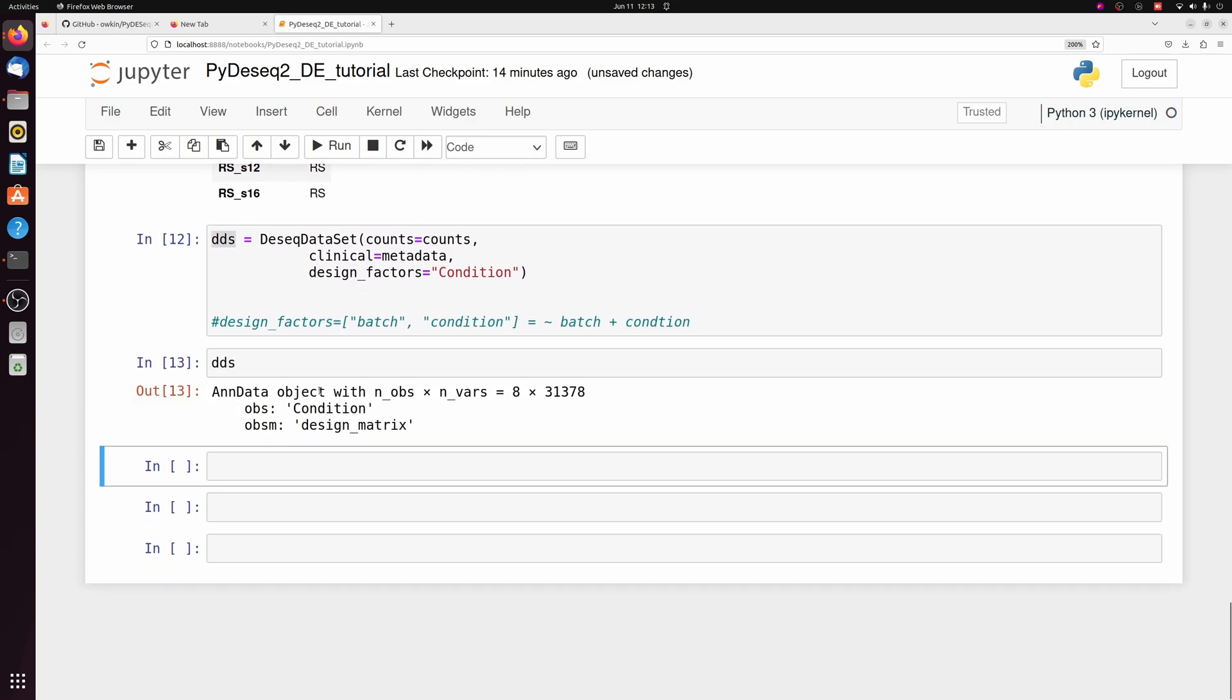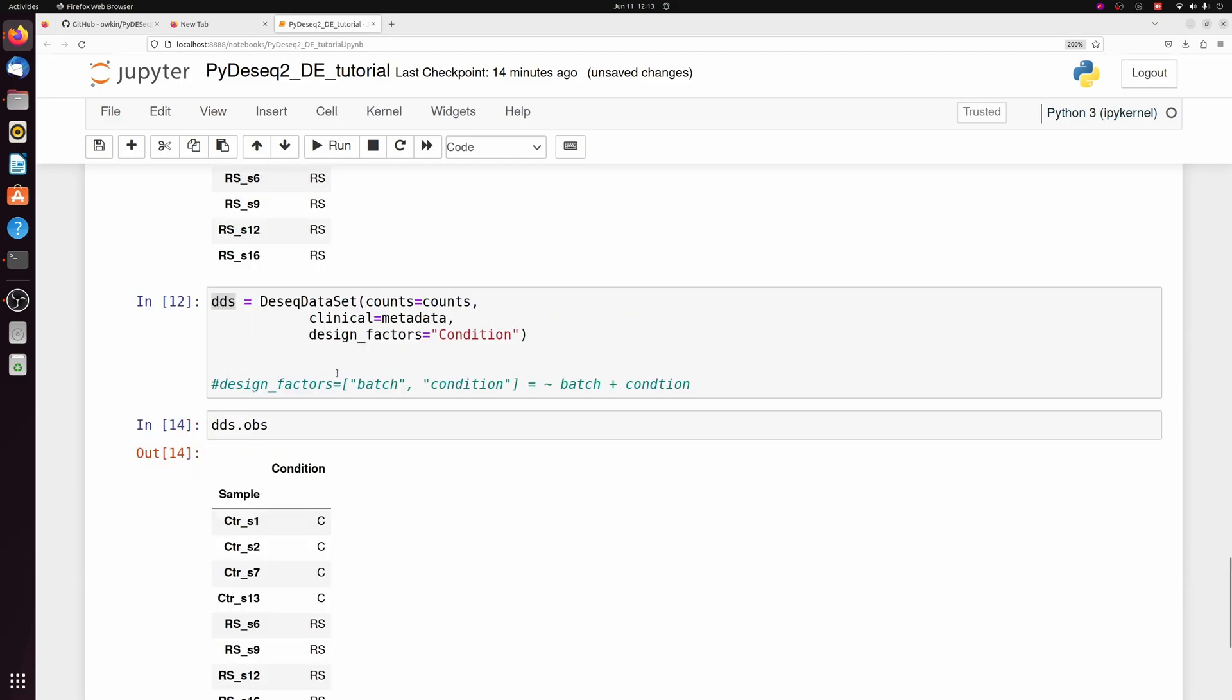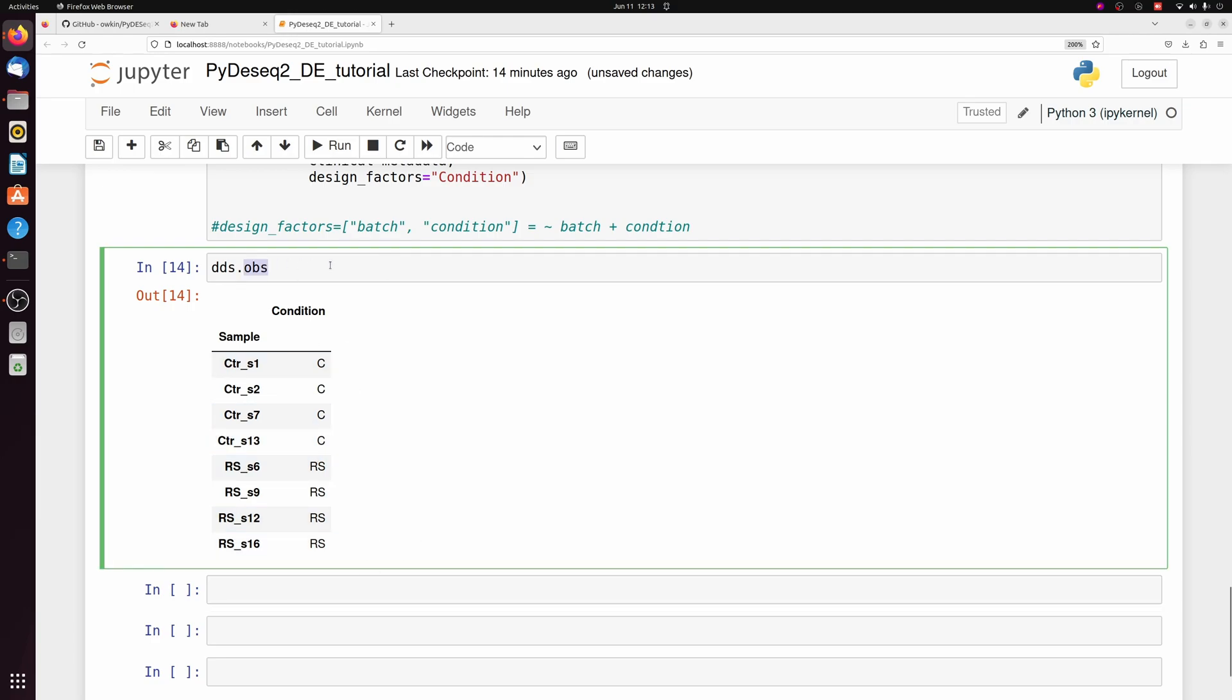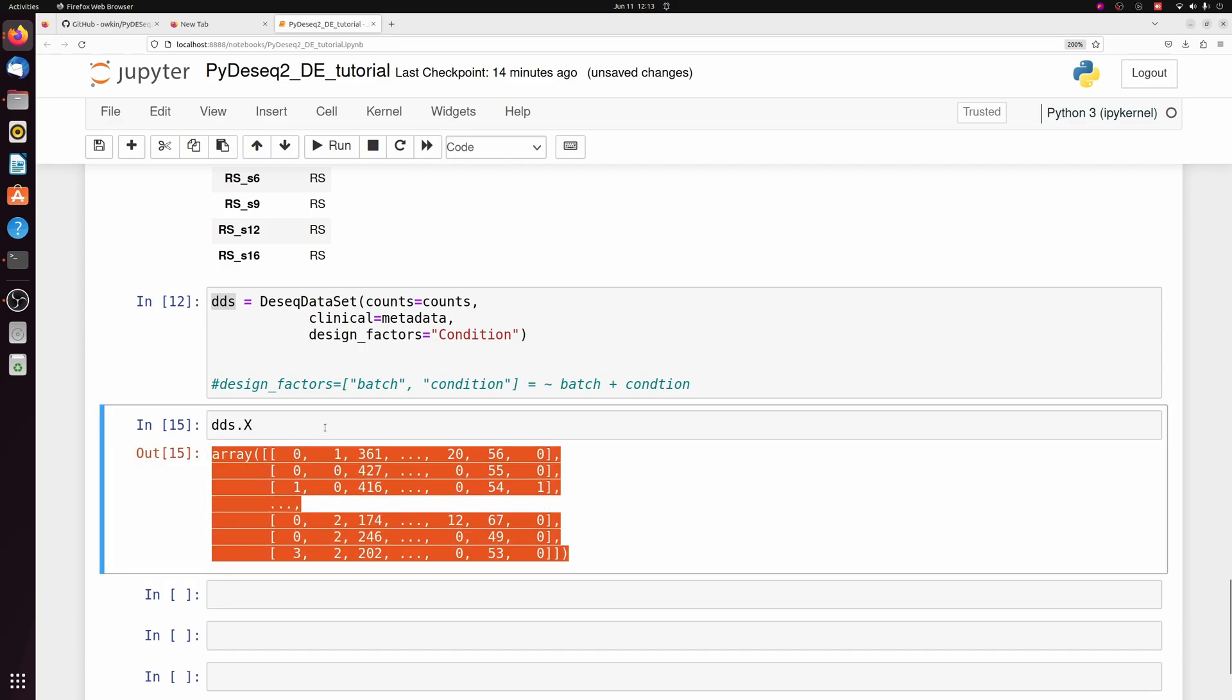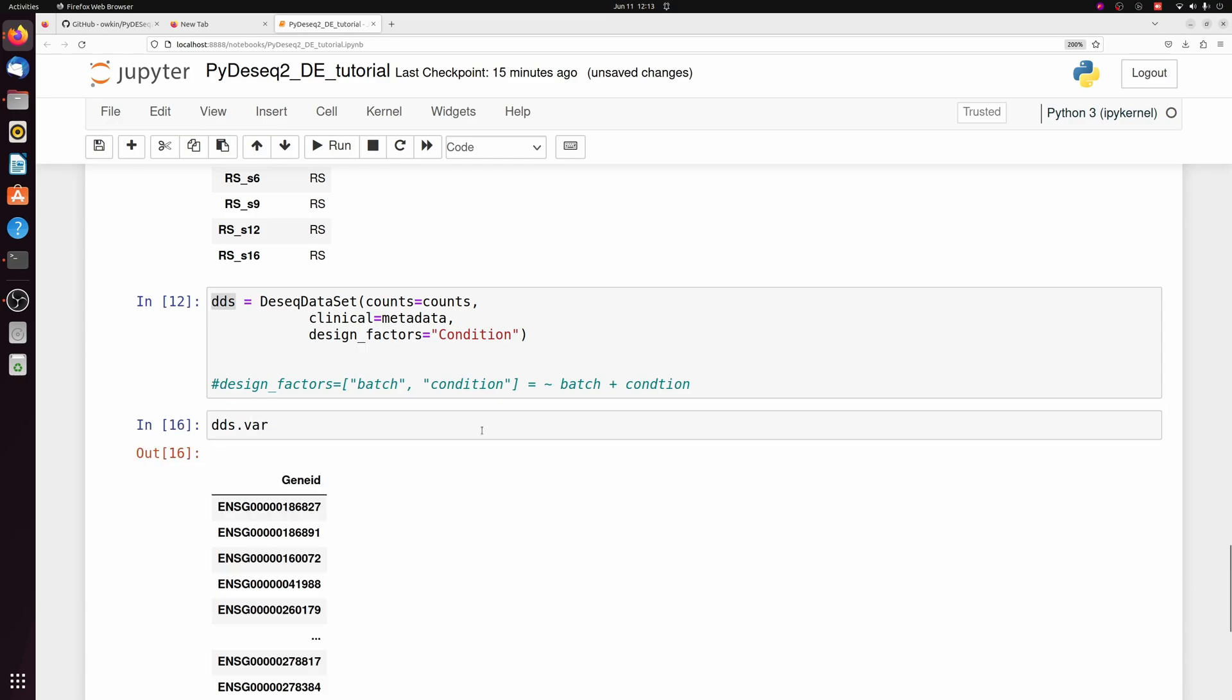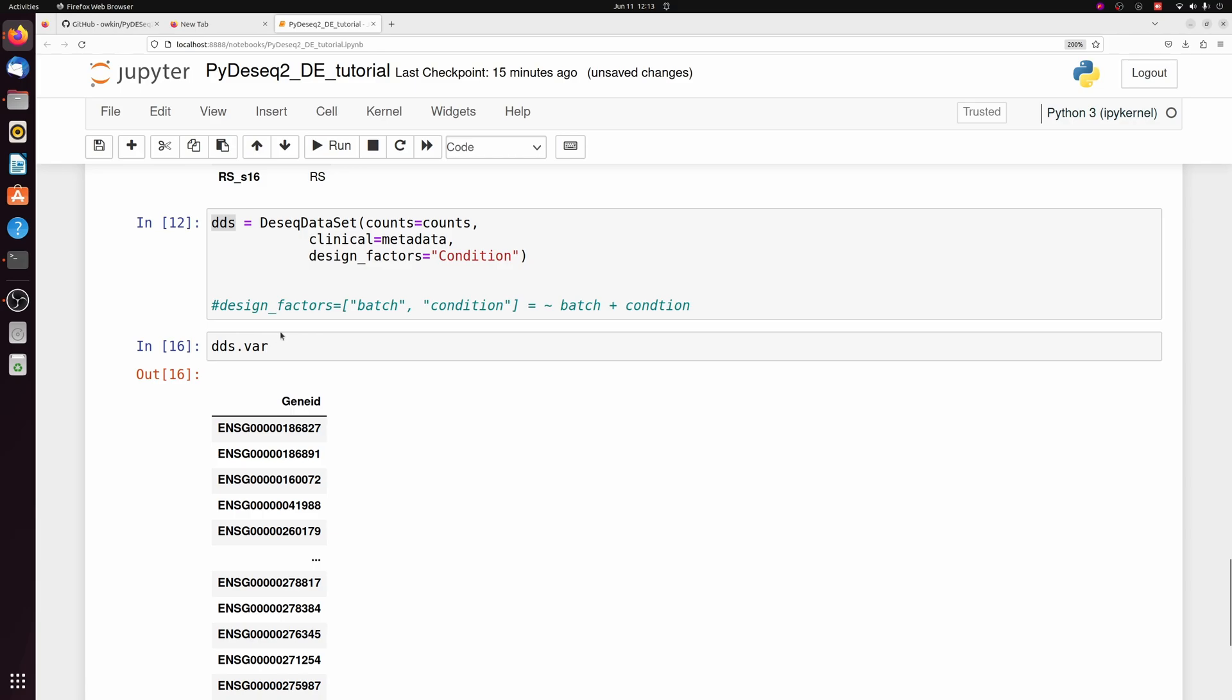So if you're familiar with scanpy, it's actually an AnnData object now, where if you look at the obs, you have your observation data frame, which is just the metadata. You look at x, it's the actual count matrix. And then if you look at var, it's the gene IDs.